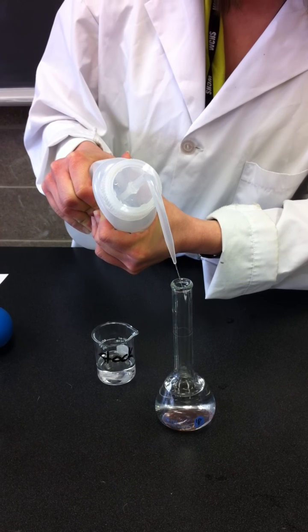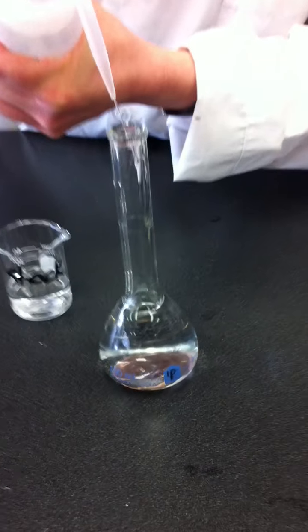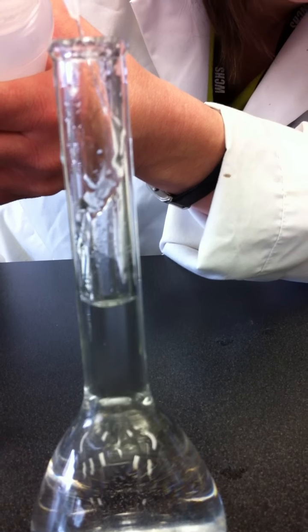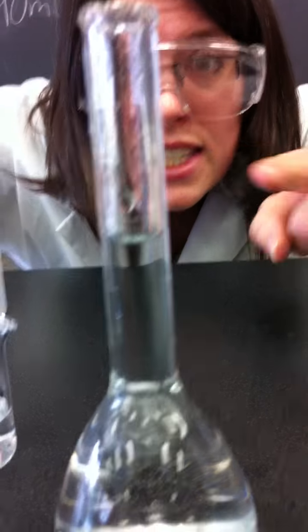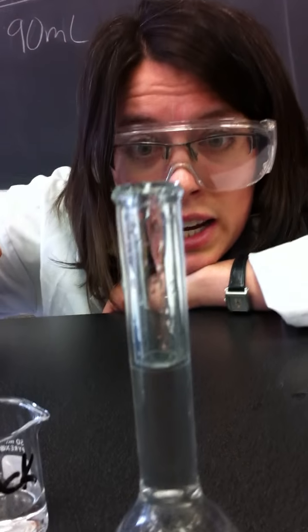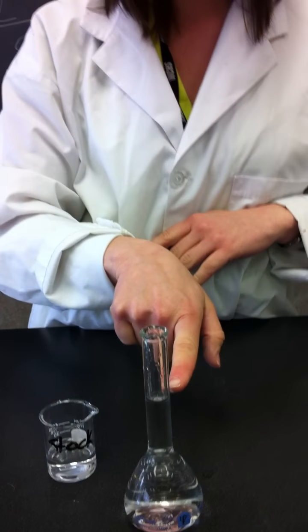Once you get into the neck of the volumetric flask, you want to go a little bit slower because the solution will rise pretty quickly, as you can see. And when you get very close to the line, you can switch over. Okay, so about this point now, I can see my meniscus is quite low, so I'll switch over to a mini pipette, or there we go. That looks great. So the bottom of the meniscus should be in line with the etched line.